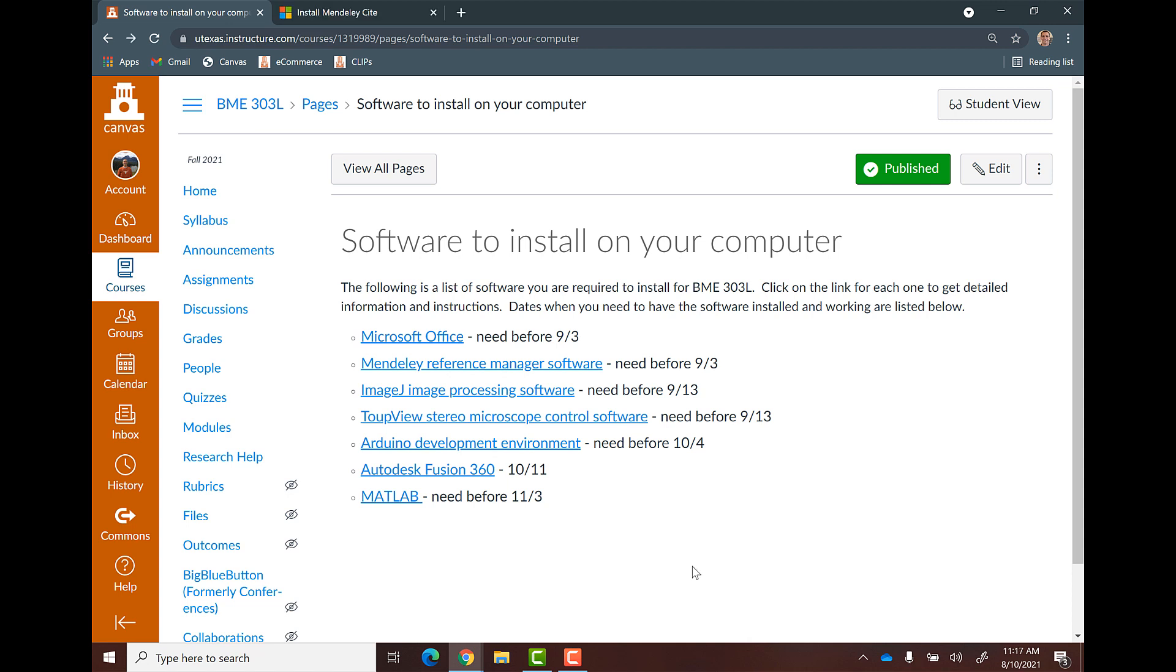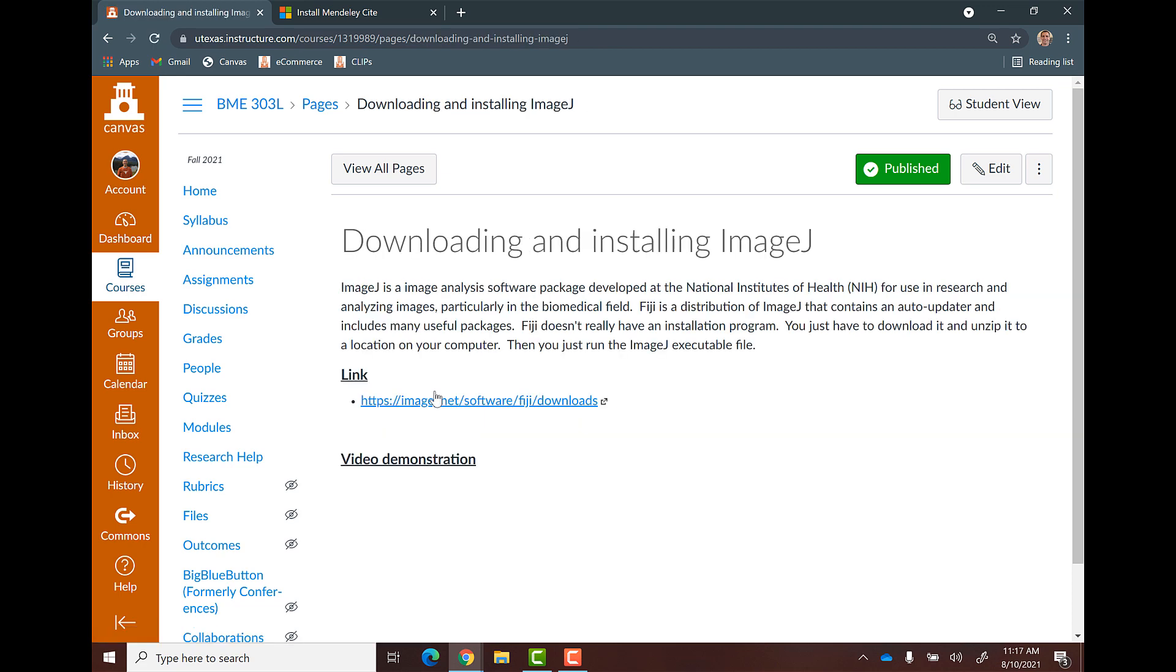All right, the next piece of software I want you all to install is called ImageJ. ImageJ is an image processing and analysis package that's really cool. We're actually going to download something called Fiji, which is really just ImageJ, but it's kind of like a whole package download.